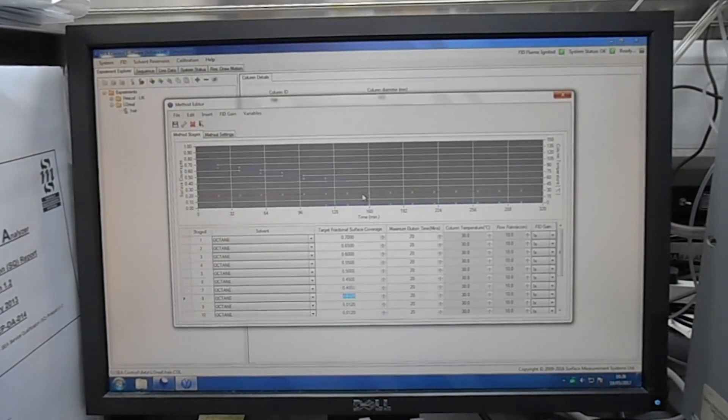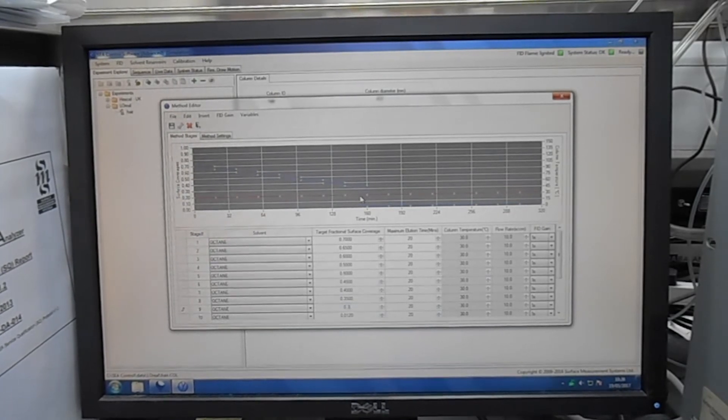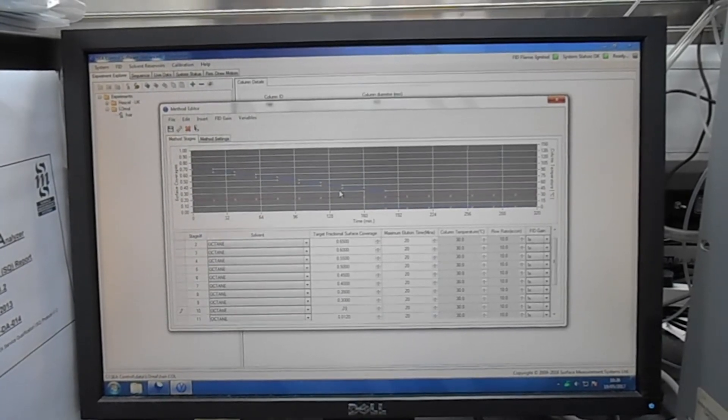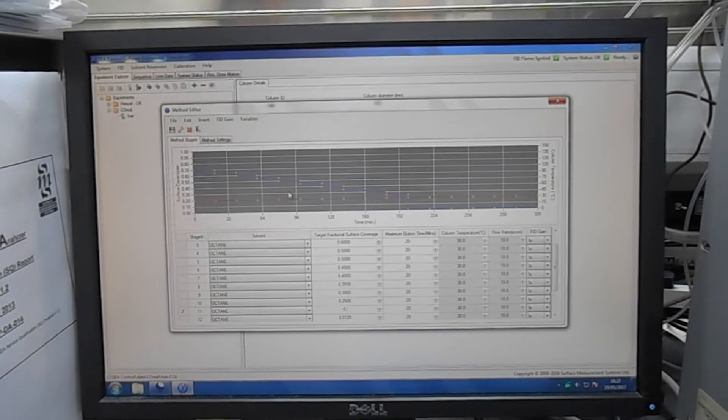So right now I'm generating a method with different points of my isotherm, only using one single component.